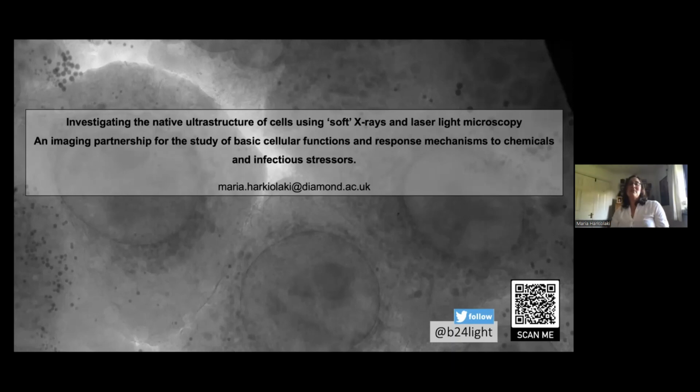No. So it depends on what expertise our users have. For example, the lab in Japan sent us one of their students. He prepared samples with us. We have all the wet lab facilities and all the cryopreservation and everything. And then once they had done the first round, he went back. And because at most universities and institutes there will be a plunge freezer somewhere, it's the sort of thing that most universities will have one or two of. Cryoprotection and having cryopreserved samples is a major hassle for most labs, people don't just have liquid nitrogen lying about.